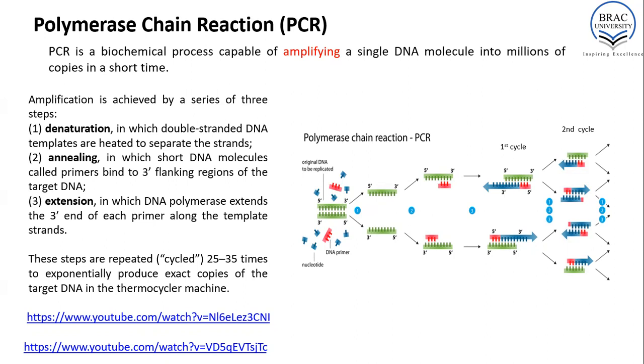The only requirement for doing a PCR is some knowledge about the DNA sequence of the target fragment, required to initiate a PCR experiment. PCR uses a temperature-dependent cycling process, where temperature is used to proceed through various steps catalyzed by the enzyme DNA polymerase, which does the DNA synthesis.